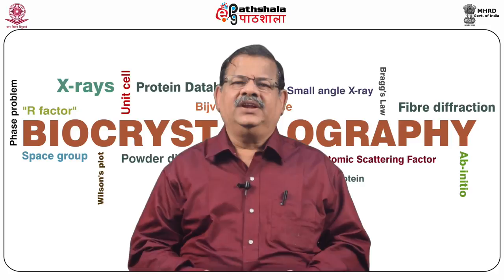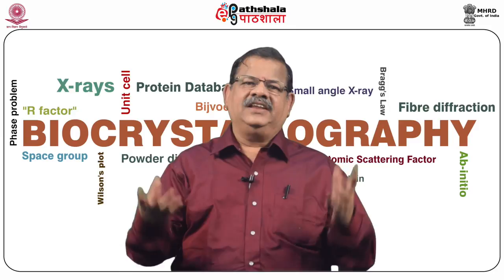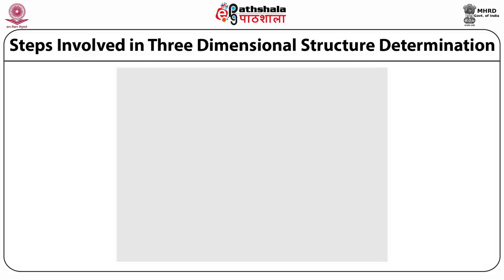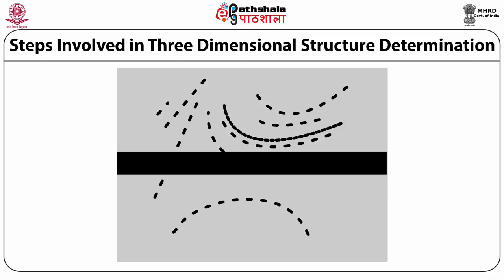Later, scanners came, and at present, powerful devices like charge-coupled devices and imaging plates are used for data collection. So within half an hour, if you want to just see whether your molecule is there in the crystal or not, we can do fast data collection also. This just tells you the hardship faced by the crystallographers in 1950.